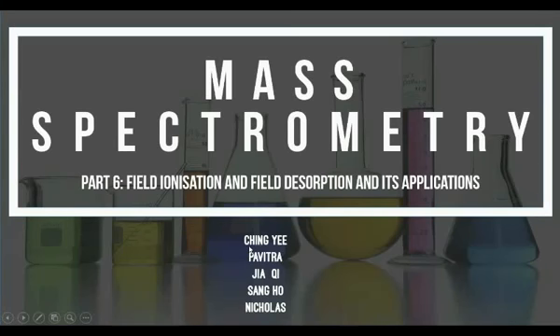For this video, our group will discuss Topic 2, Mass Spectrometry Part 6, about field ionization and field desorption and its applications.